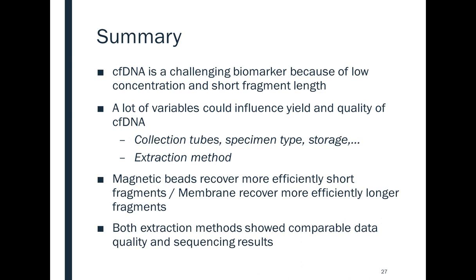while this may work, generic nucleic acid kits are not optimized for cell-free DNA extraction, so the sensitivity and the recovery will not be efficient enough, and I think the output would be poor.